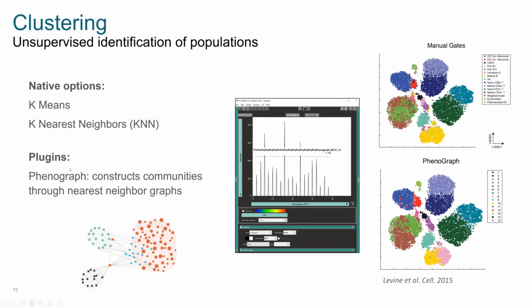So this is why folks have started favoring plugins that offer other clustering options like Phenograph, because it doesn't really require a training data set or for you to estimate how many clusters need to come out of the data. So it's a little bit more approachable if you don't have a whole lot of knowledge about what you expect to find out of your sample.